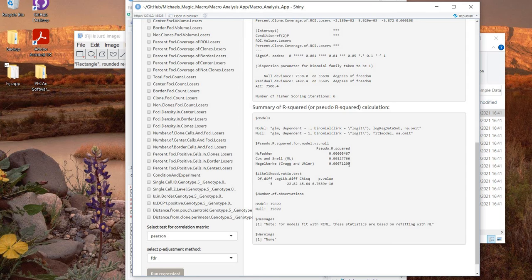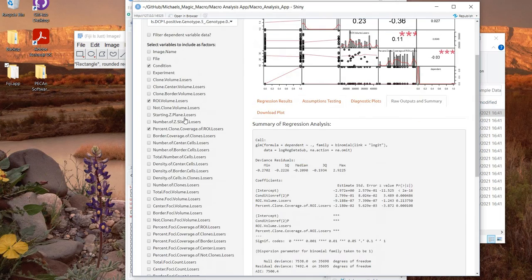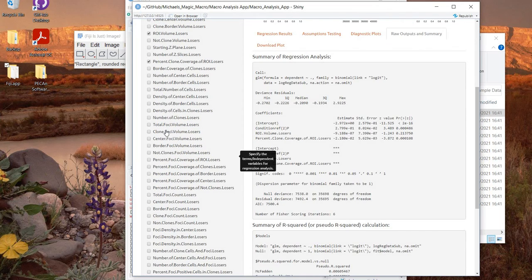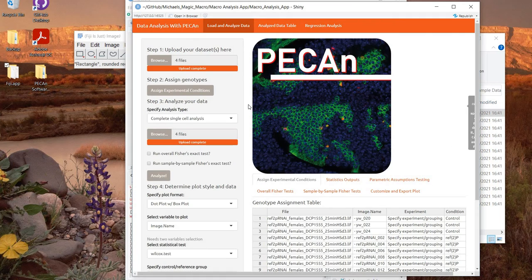If we take a look at the pseudo R squared, it's saying that our model is doing a very bad job. We haven't done a good job of picking and optimizing which factors are good predictor variables to help us understand which cells are dying. So we would go back to the drawing board, pick a few more, see which ones we have a good argument for, and play around with it until we have something that works. But we don't have to do things this complicated and fancy. These are powerful tools, but they're a bit more work. There are other things we can do.